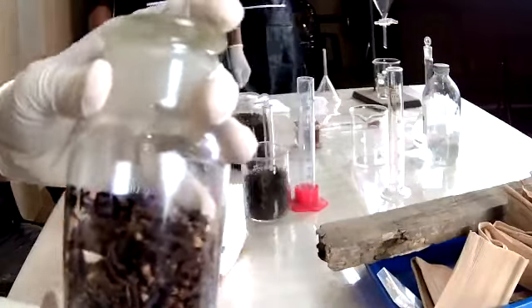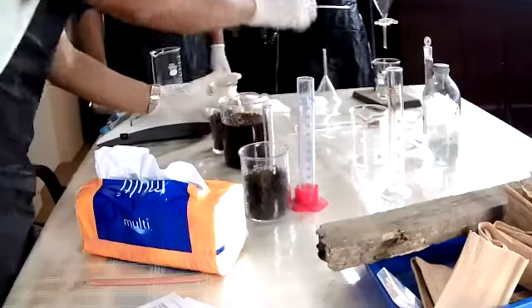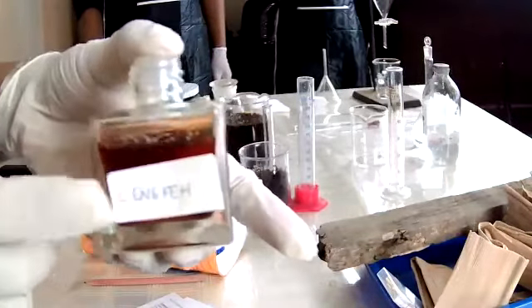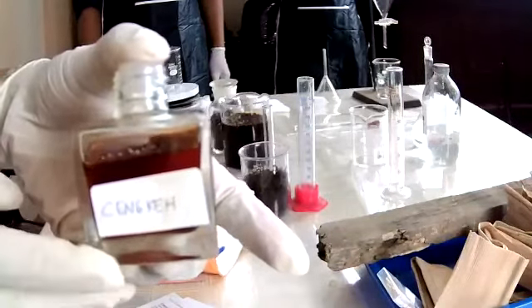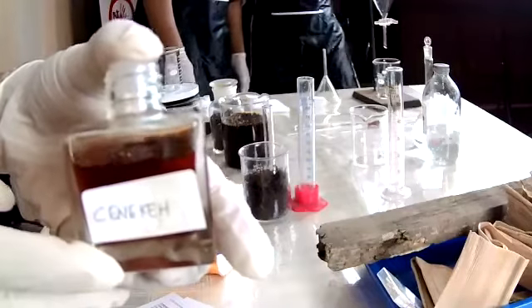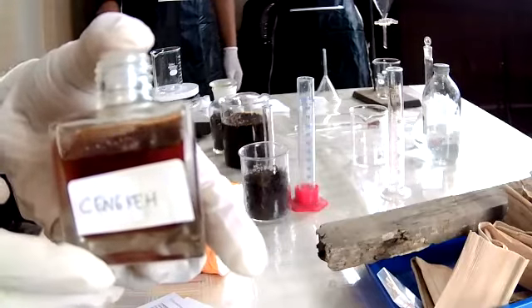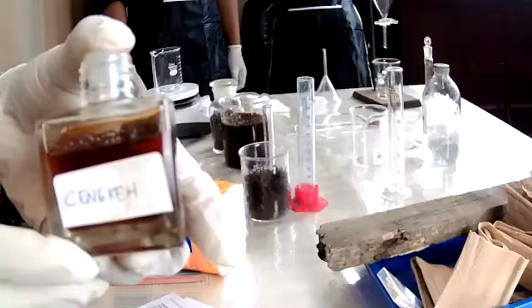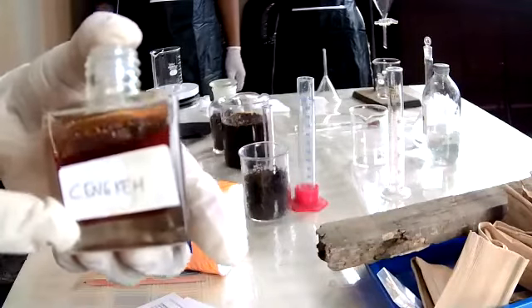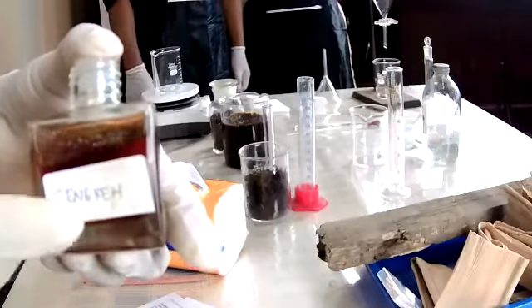And we want to make sure that we have good quality of cloves. This is the oil, the extract or the clove extract. This is actually from the leaves. The composition or the properties are similar, but not exactly the same.